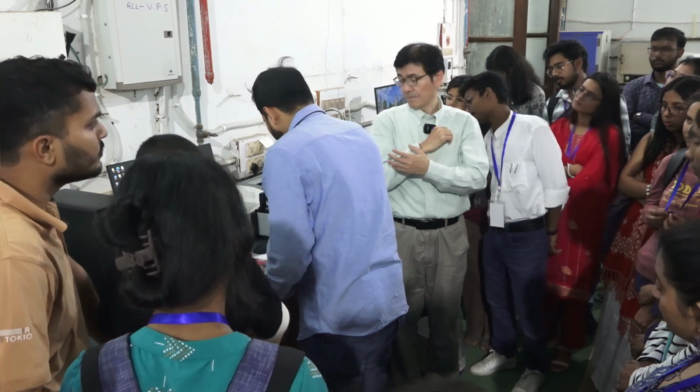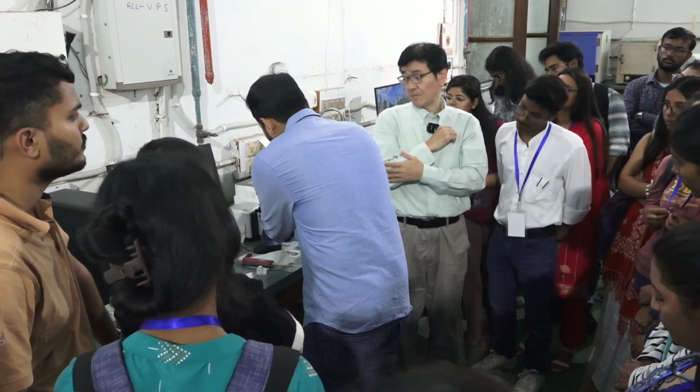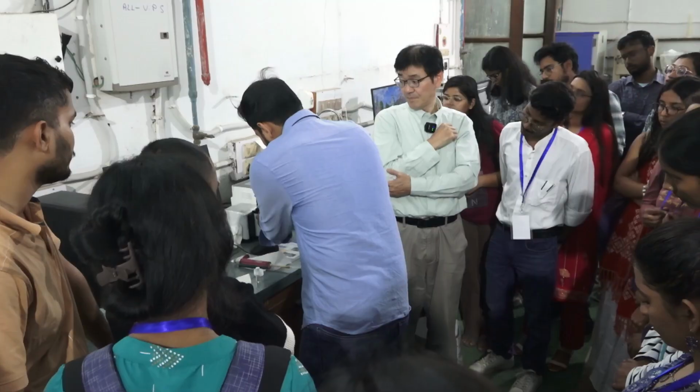Then now he touches the prism to the liquid sample.